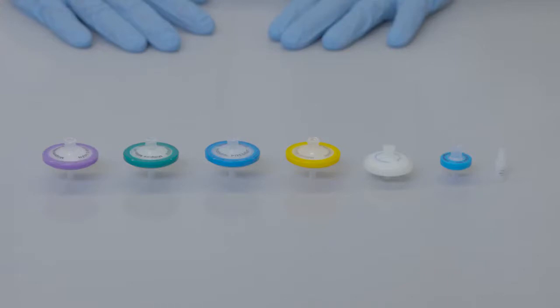And the following syringe filters are bi-directional: 13mm, 25mm hydrophilic PTFE Millex, and 33mm Millex.